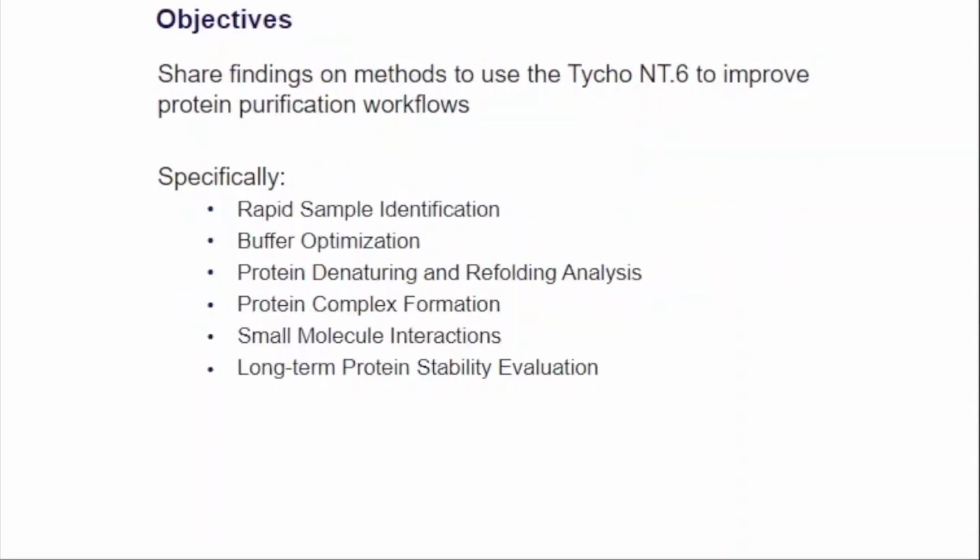The objective of my presentation today is to share with you our findings on methods to use the Tycho to improve our protein purification workflows. More specifically, I'll be discussing rapidly identifying samples, optimizing buffers, denaturing and refolding proteins, the formation of protein complexes, the evaluation of small molecule interactions, as well as the evaluation of long-term protein stability.